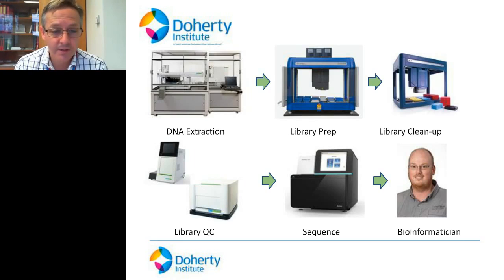You can outsource these tasks, but it does potentially increase the turnaround time. And if you're a laboratory that needs to have answers in a reasonably short turnaround time, then at this stage it's more likely that you're going to have an in-house approach.